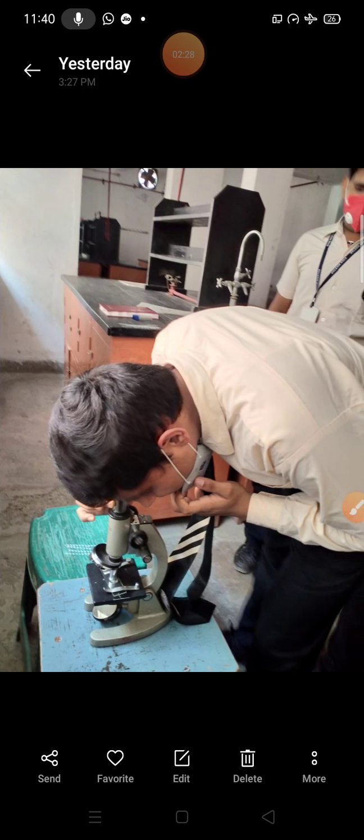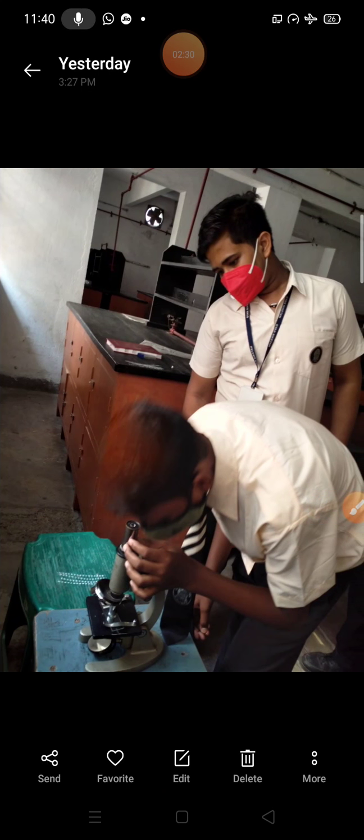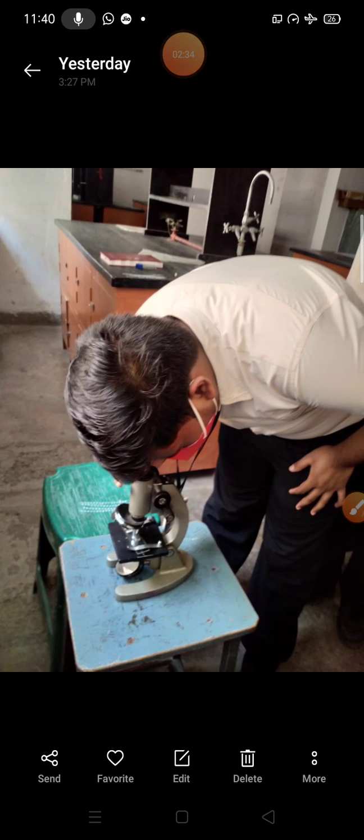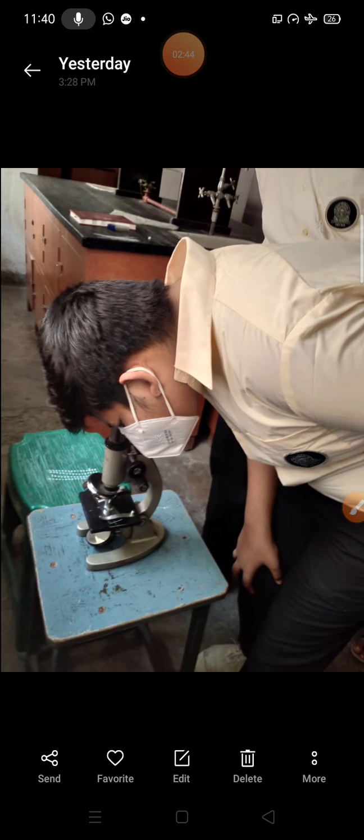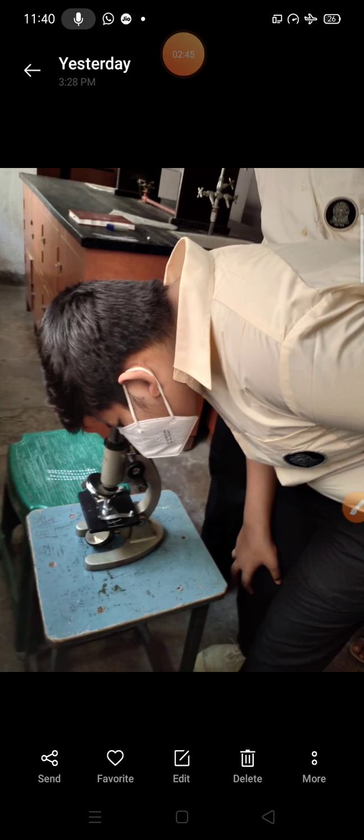And as you can see, this was done by some of your fellows. And then, what are you seeing under the microscope about the striated muscles?